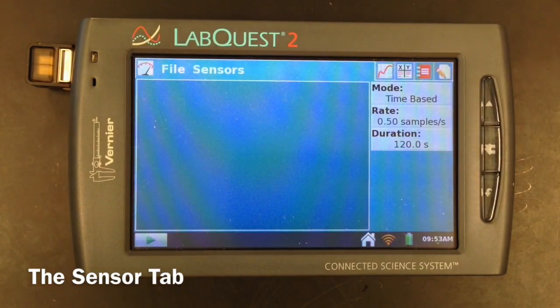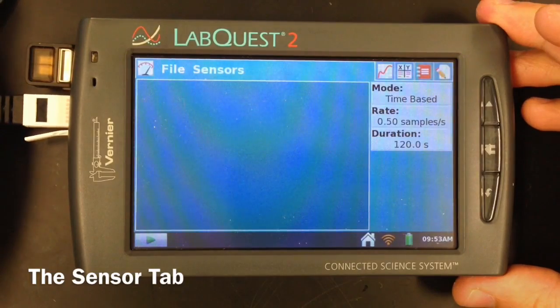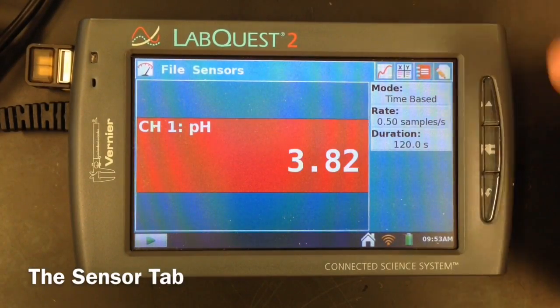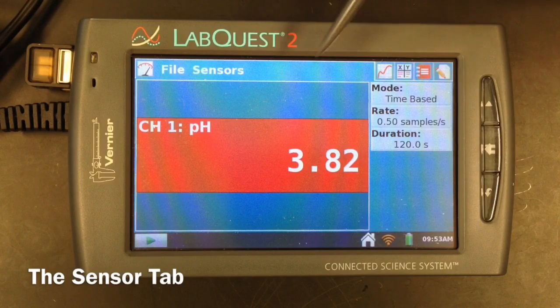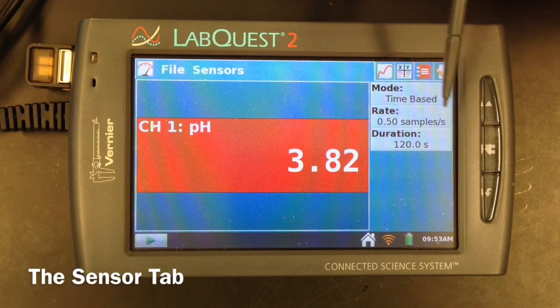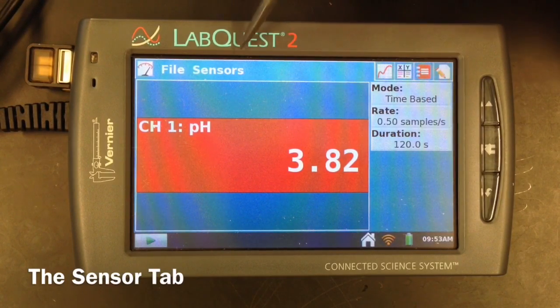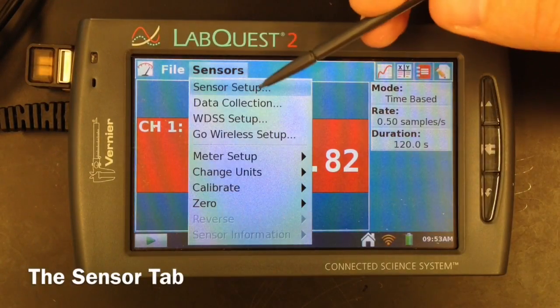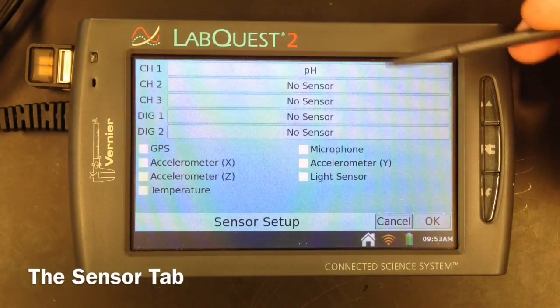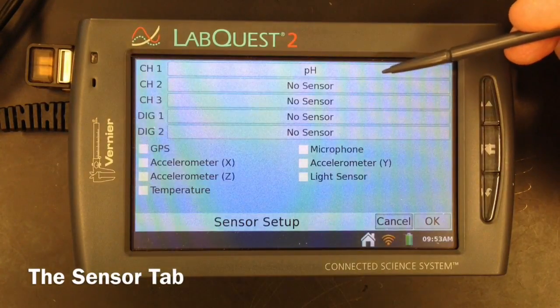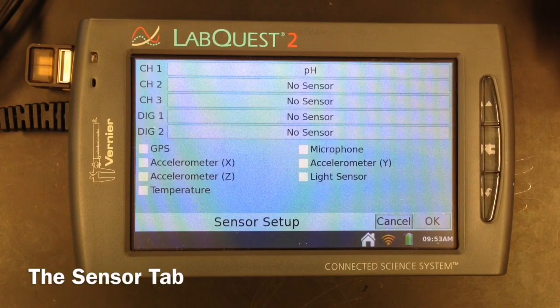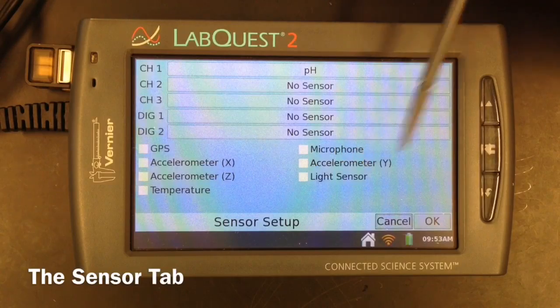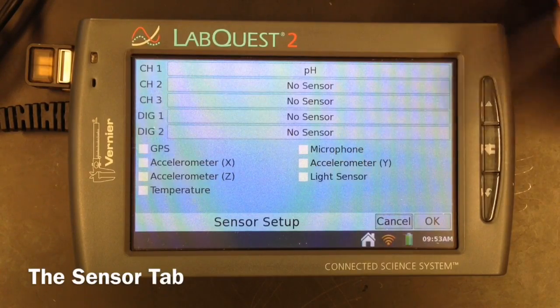The first main screen is the sensor option. If we plug in the pH sensor, you'll see that it automatically detects what kind of sensor we're using and starts giving you a reading instantaneously. However, if some of the older sensors do not automatically detect, under the sensors menu, sensor setup will give you the option to manually select what kind of sensor you plugged in, as well as the option to turn on any of the built-in sensors that each LabQuest has.